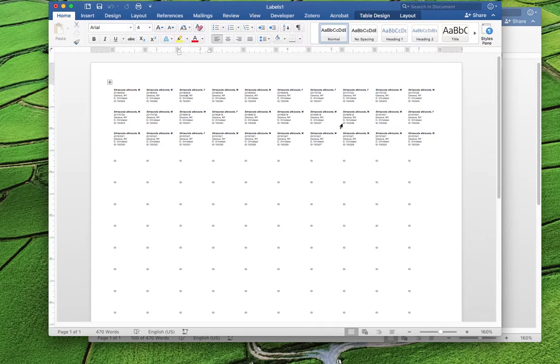You can do this with 10 specimens, you can do this with thousands of specimens. This process encompasses all shapes and sizes of this sort of thing.